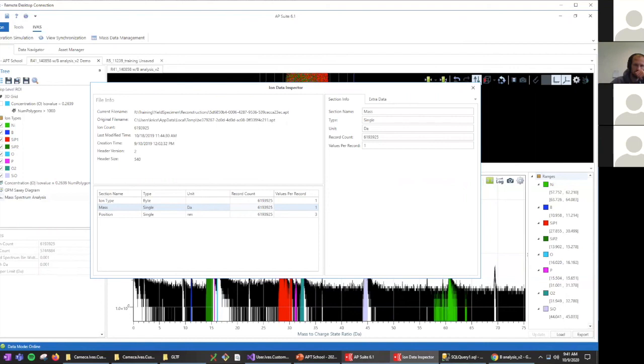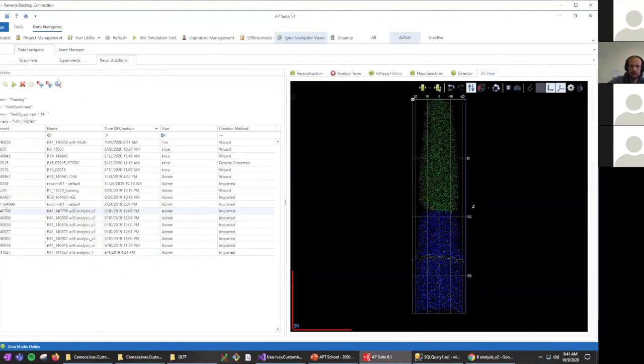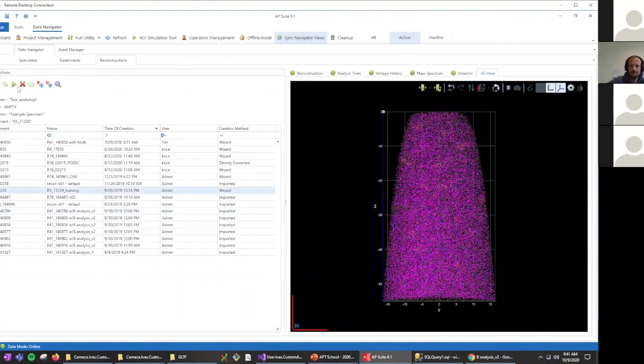Maybe I'll start with a comment there, and Markus will probably have his own thoughts on that. I think the most important thing for us on the CAMECA side is consistency. I think you've made a lot of data already accessible. Of course, what you can and cannot make accessible is very often a business and engineering decision, of how much insight you want people to have in your detector technology.